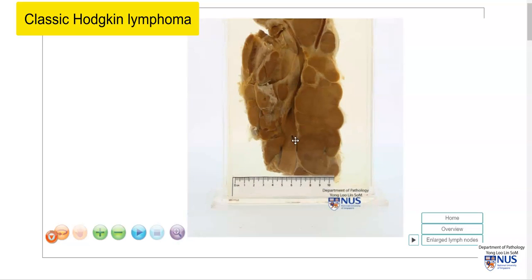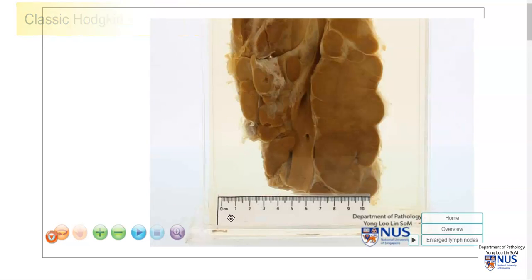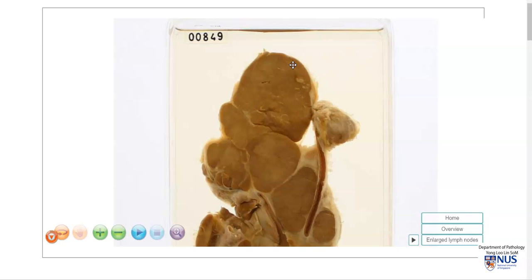Let's look at the scale. At this point is the 5 cm mark, and if we take a look at this very large node here, it is actually larger than 5 cm in maximal dimension.